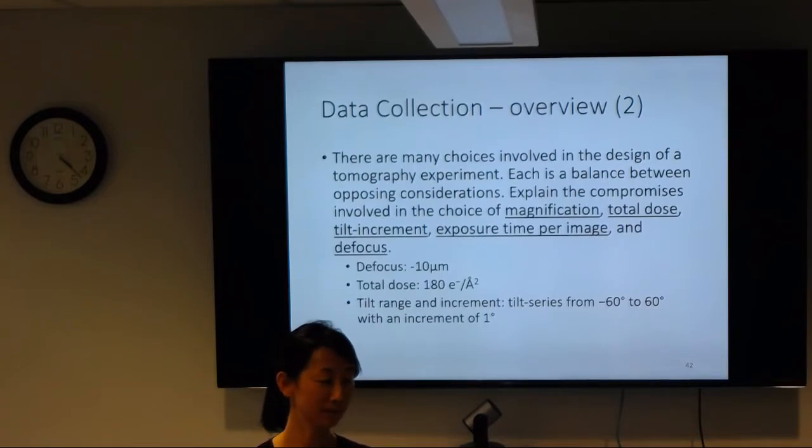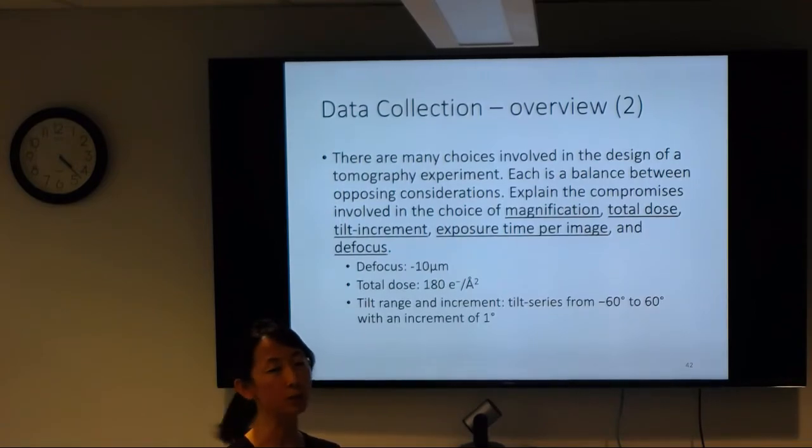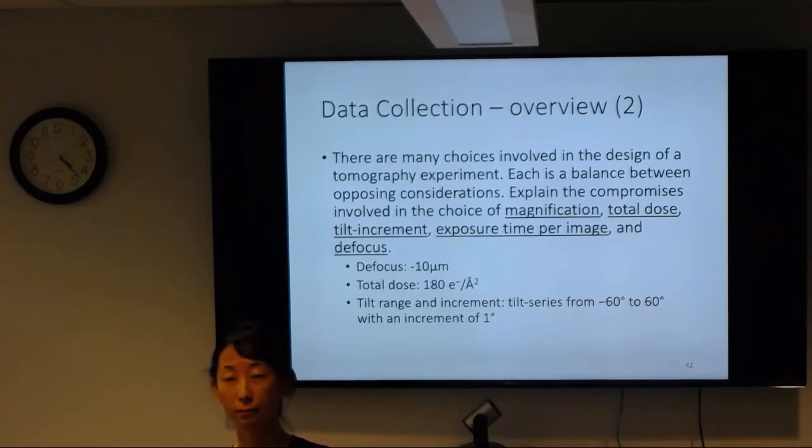Going further and zooming in, you limit your view. Also, after alignment, with the errors building in during alignment, you won't achieve a 3.5 angstrom resolution map anyway. So what she just said goes back to the lecture last week, if you remember Lorenzo talking about the Nyquist limit of your image. So picking magnification and pixel size, think about the Nyquist limit when you're setting up your data collection.